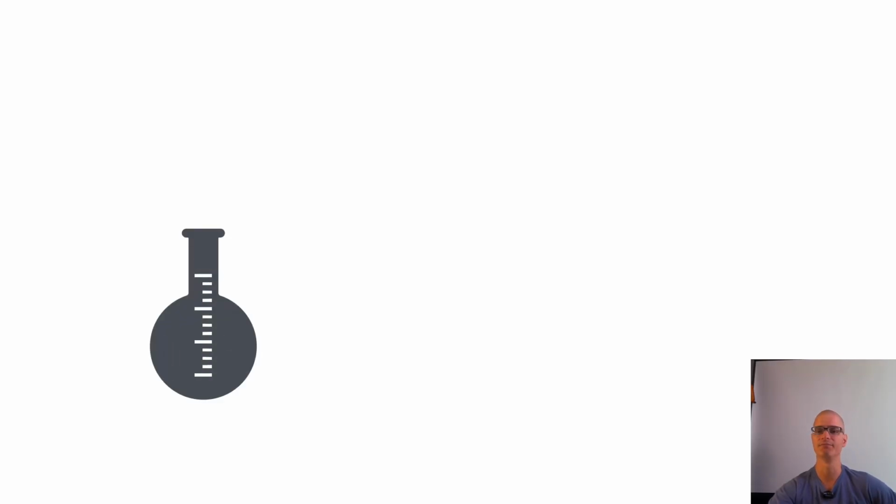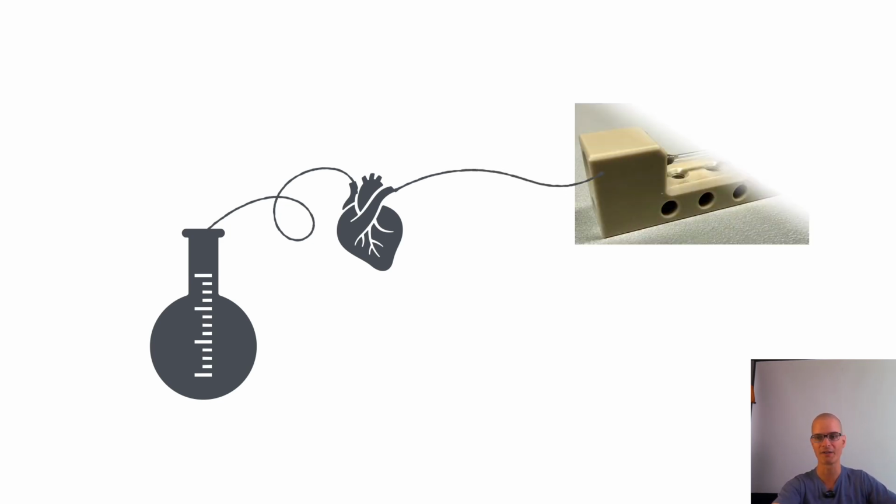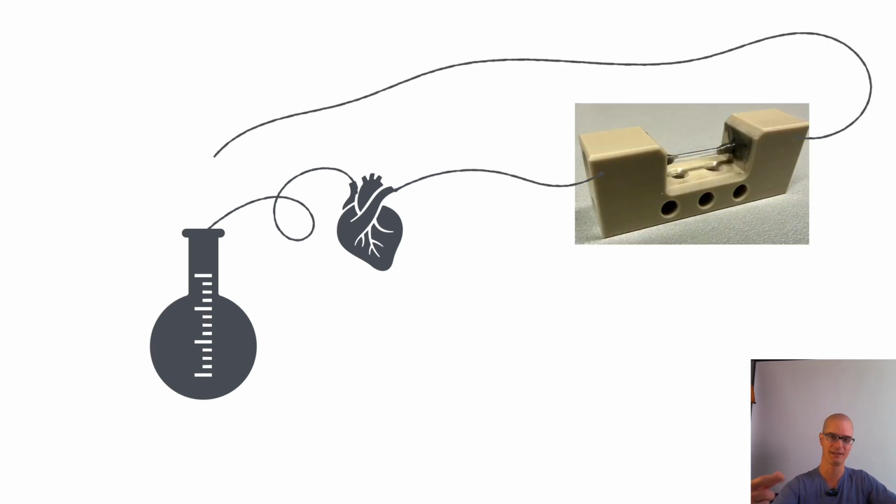They set up an in situ experiment at a synchrotron by having a lab scale reaction right next to your instrument, attaching a tube to a pump, so you can pump out a little bit of the reaction liquid, pump it through your measurement cell, and then pump the remainder back into your reaction flask.